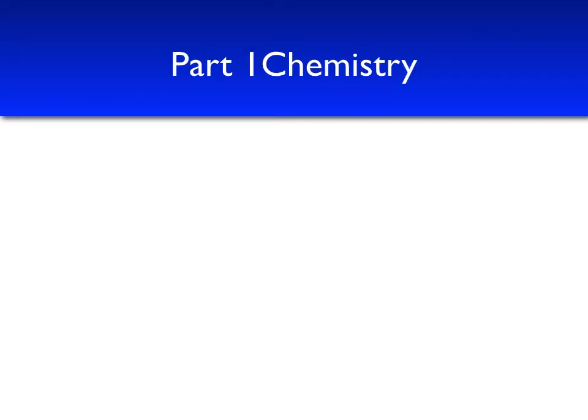Today's chemistry focuses on the chemistry of iodine. The oxidation of the iodide ion, I-, to elemental iodine in solution, I2 aqueous, and the reduction of I2 to I-. We call this chemistry in this type of titration an iodometric calculation, or titration. Let's look at how this works.